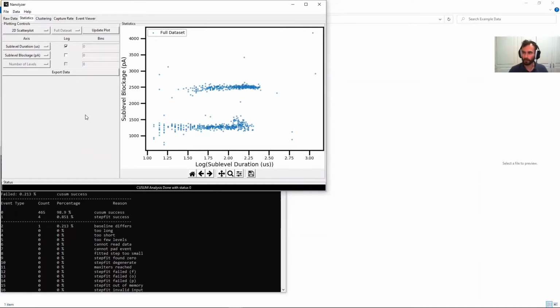In this video, I'm going to take you through one of the most powerful and generally useful features of Nanolyzer, which is the data management and database management package. Once you've completed an analysis, as you saw in the previous video, we now have all of this metadata accessible to us about the event. We have dwell time, blockage levels, maximum blockages, number of levels, all kinds of things. And we can now use those to segment our data set into interesting subpopulations.